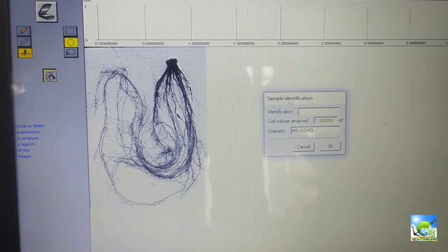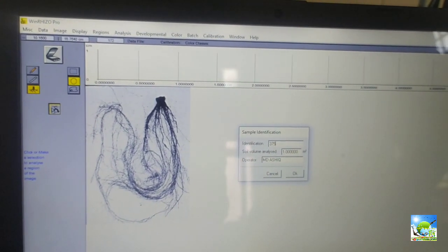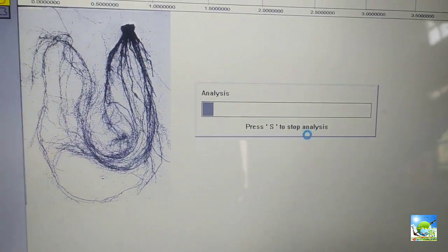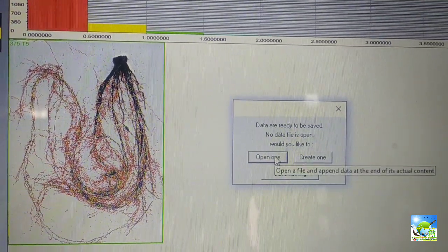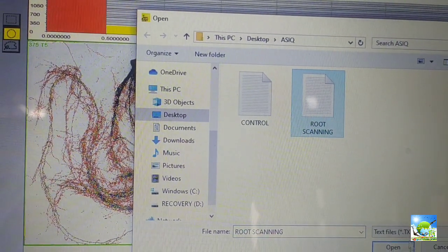After scanning, right-click on the image and give a sample identification number. Click OK and allow for analysis. Then click on 'Create One' or 'Open One' — you can save in an old file or save as a new file. Your data will appear on the left side.